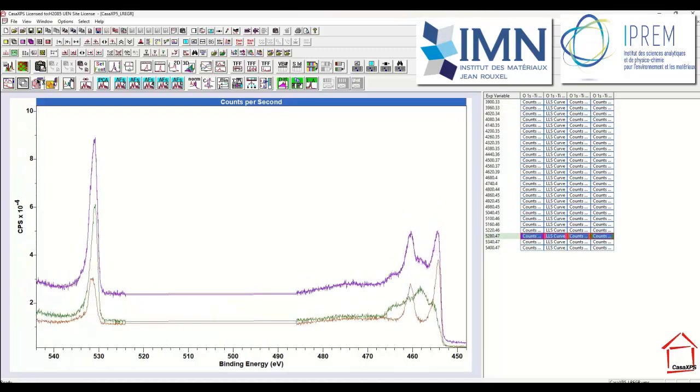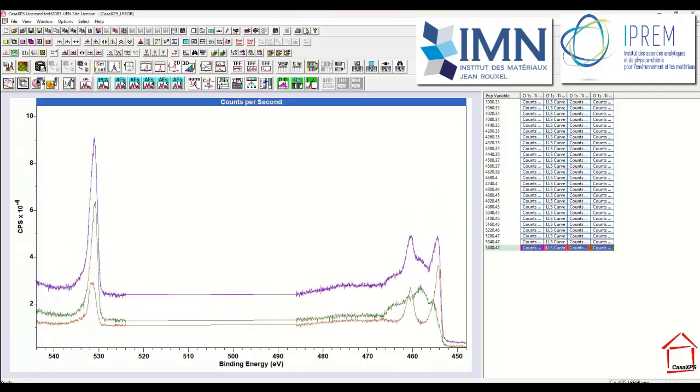So here we can see that we have a plausible answer in terms of we've got some titanium that is clearly related to oxygen, that it has a much more metallic-like look to it, so a reduced oxidation state here. We then have another state of the titanium that is correlated with a different amount of oxygen, and these two component spectra are enough to understand what's happening in terms of these two different phases as described by these component spectra.